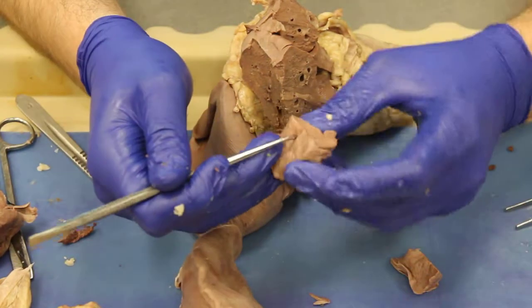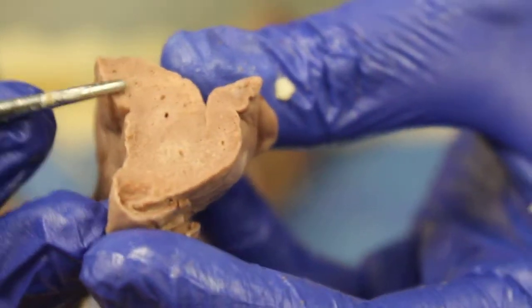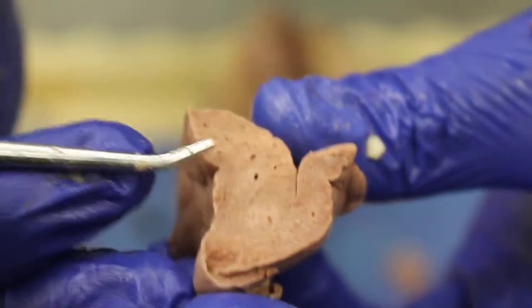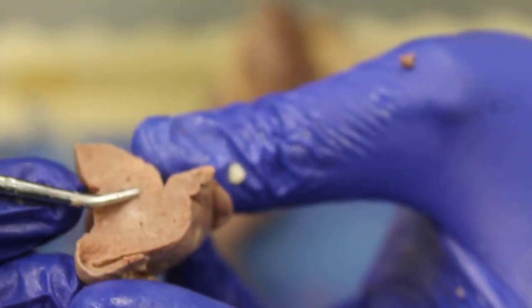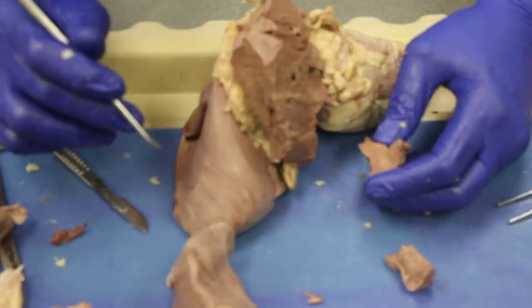But down here, I'm going to let that focus for a second. I see that there are some larger spaces there. Those indicate to me that I have some bronchioles. Those are larger airways. Those larger airways can deform when I depress them. Those larger airways that can deform indicate to me that I don't have cartilage. Now, I'm going to go back to my larger shot, and we'll get back into focus.